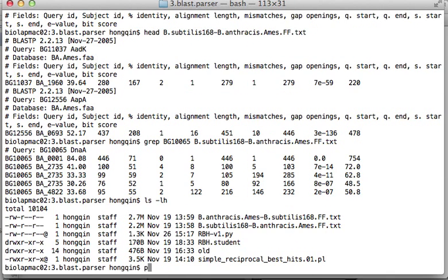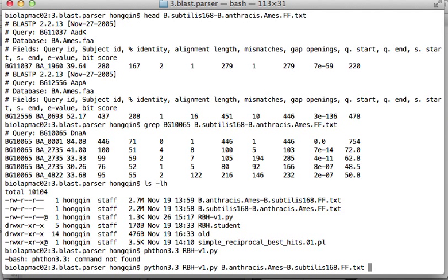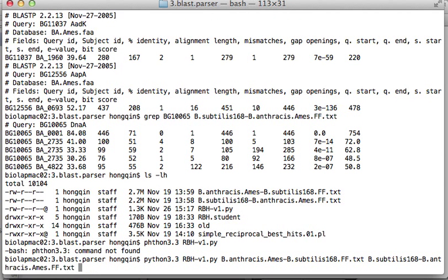I'm calling Python 3.3, ibpv1.python. I typed it wrong, sorry. Python 3.3. The first file, I'm going to call that anthracis to subtilis. The second file is subtilis to anthracis. And output file, let's just call it out_ibp.txt.